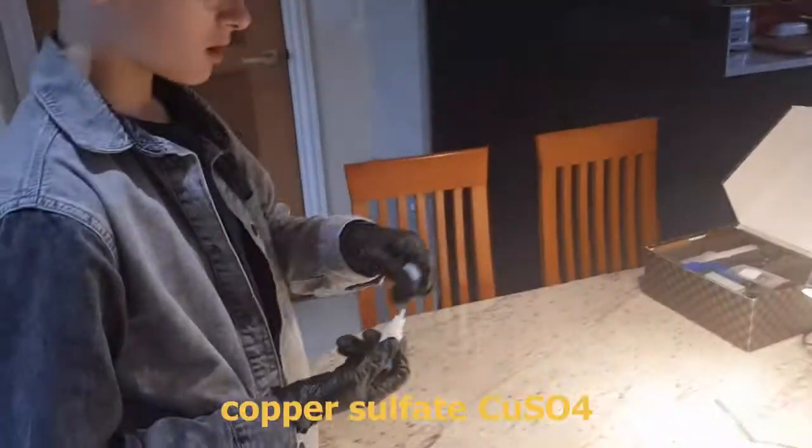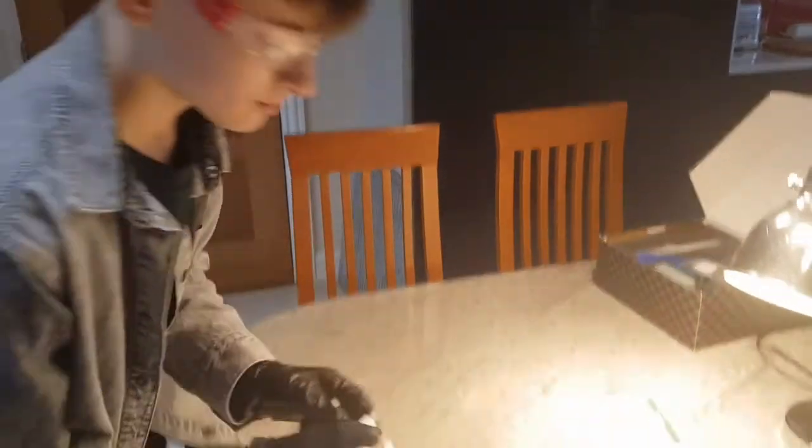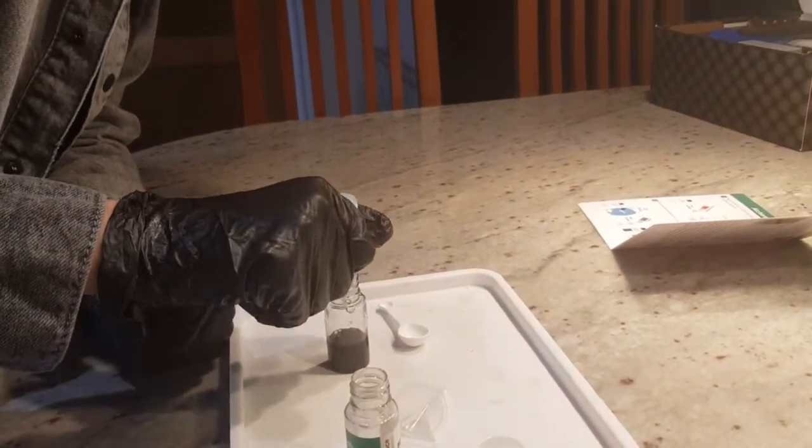Now I need to put in one home to a bottle of copper sulfate. As you can see, it's turned a dark colour.